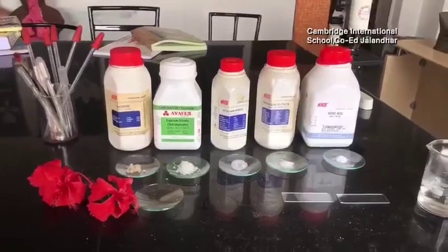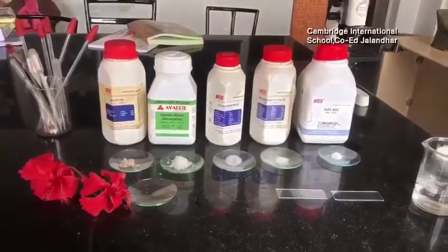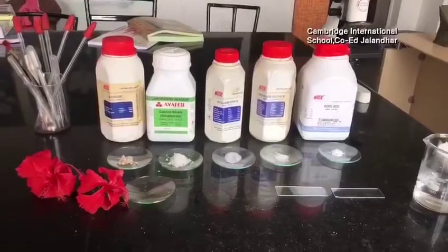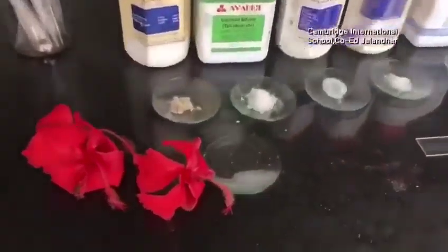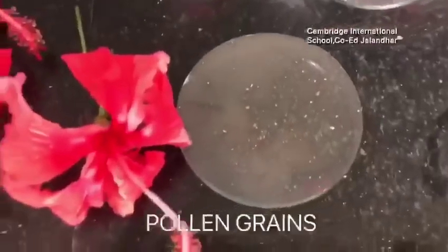Hello students, today we will be performing the germination of pollen grains on the slide. For this experiment, we are taking the pollen grains from the flower that is hibiscus.